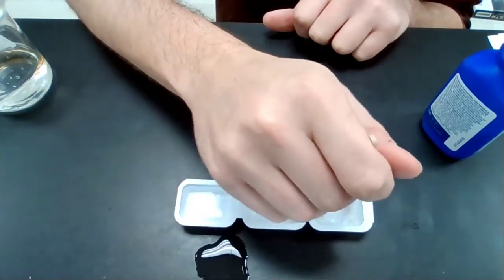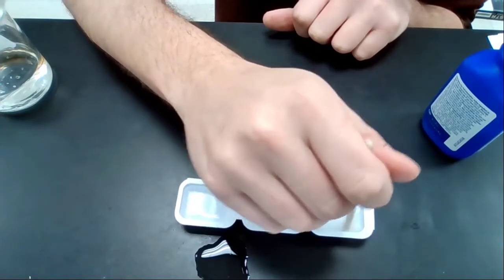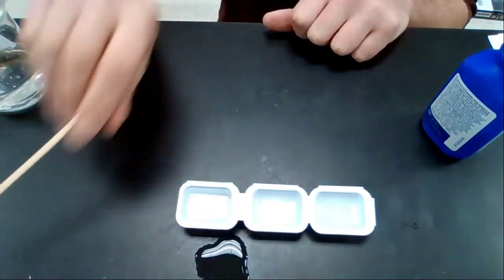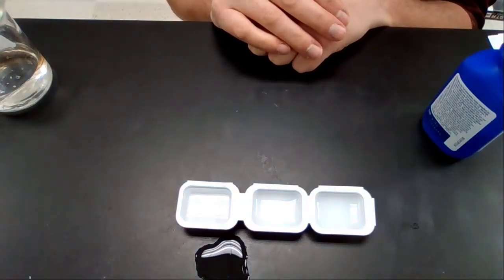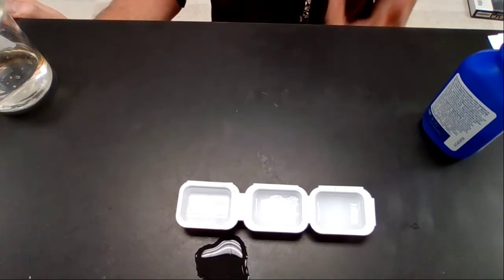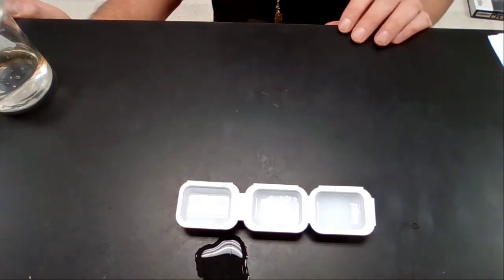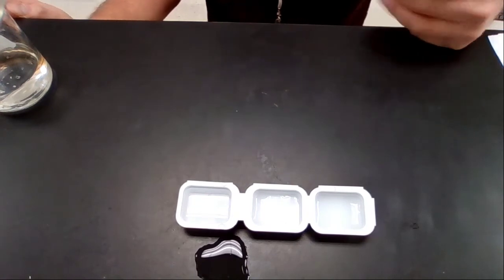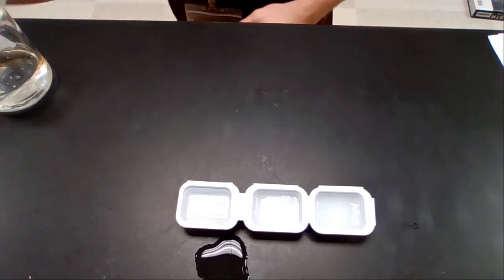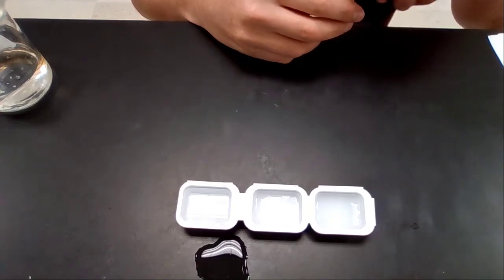Okay, let's stir this one as well. A cloudy consistency here. Step 6, obtain the bromothymol blue. So the issue here is that unlike the other ones where we could visibly see shifts in equilibrium, with the milk of magnesia, we're not going to see that unless we use a pH indicator. And you can think about what's happening when you're adding or removing hydroxide ions and how that impacts the pH of the system. So I'm going to get the bromothymol blue, which is here, and it says to add 6 drops to wells 1 and 2, and we're going to stir again.